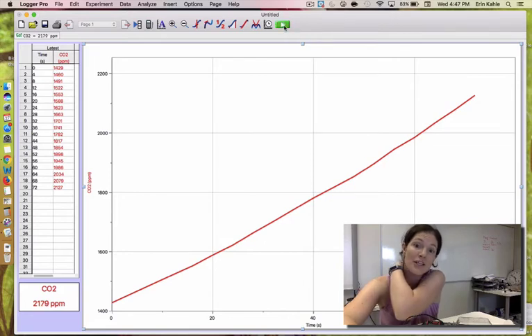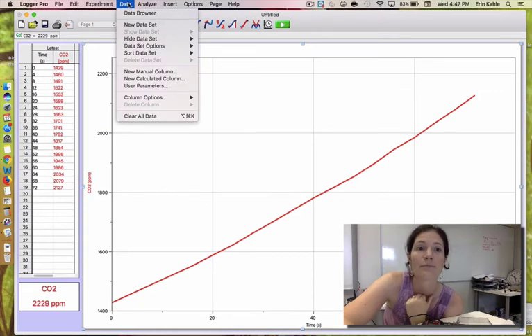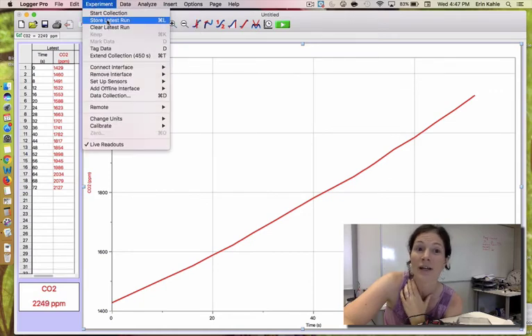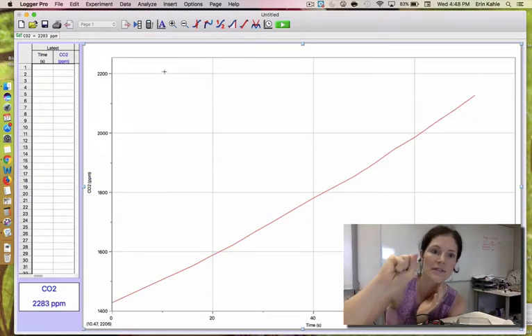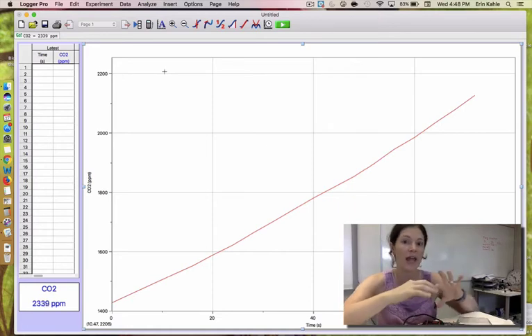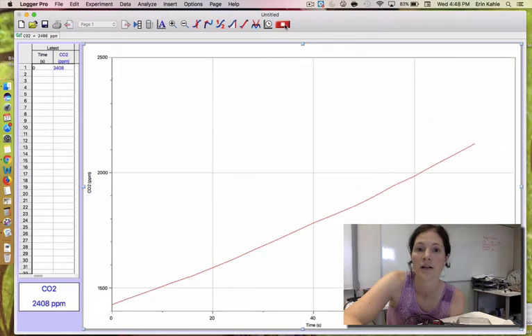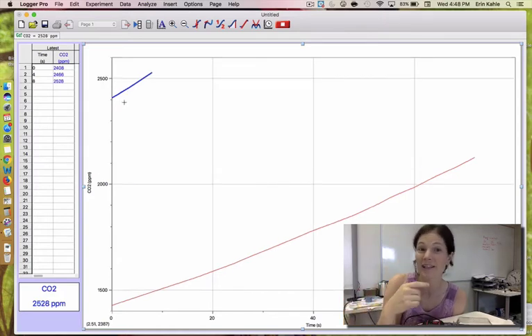So when you stop collection, the thing that I cannot stress enough is, if you do store latest run, that will save your run so that I could collect again. So let's say I set this up again, and I'm going to start collecting another run on the same. Now this probably has a concentration somewhere up here. But what I would suggest is, each person probably will be collecting 6 data sets.